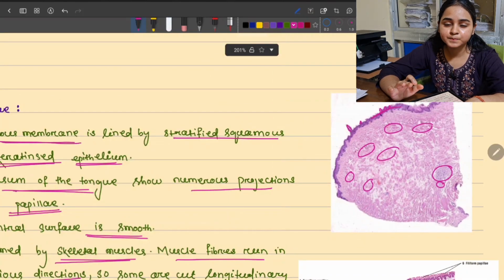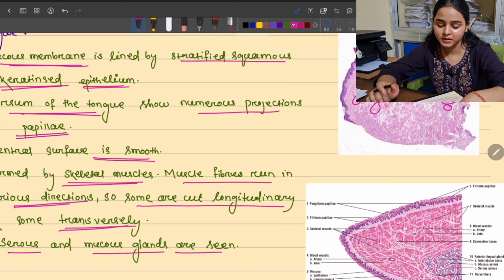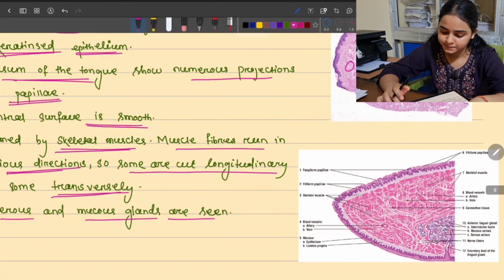So tongue is a very easy slide to identify, because इसका शेप भी ऐसा ट्रायंगुलर ही होता है स्लाइड में, तो तुम देखके पहचान लोगे कि ये टंग का स्लाइड ही है, क्योंकि जैसा तुम डायग्राम कॉपी में बनाते हो वैसा ही डायग्राम होता है स्लाइड में भी, इसलिए इसको पहचानना मुश्किल नहीं है. And it can be a spotter also. हमारे एग्जाम में भी 2-3 बार आया है टंग का स्पॉटिंग.